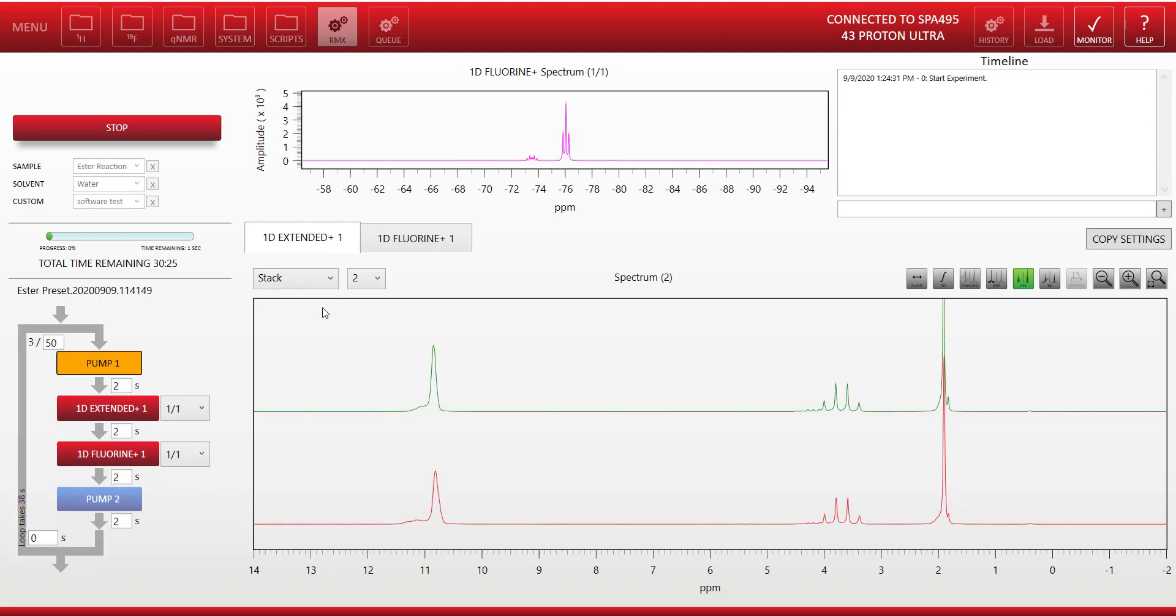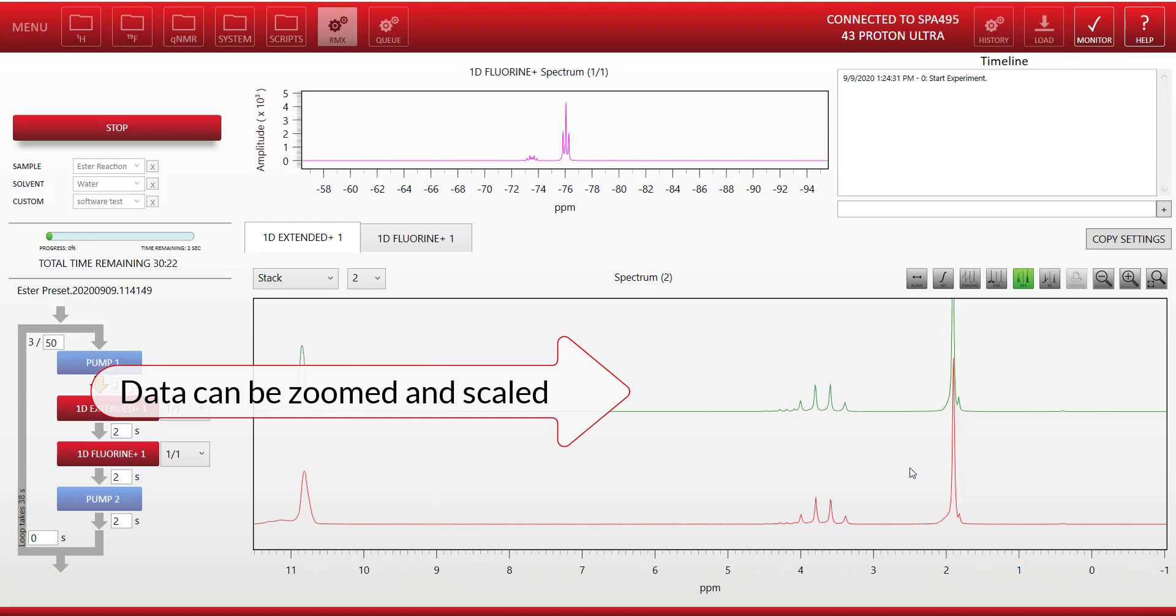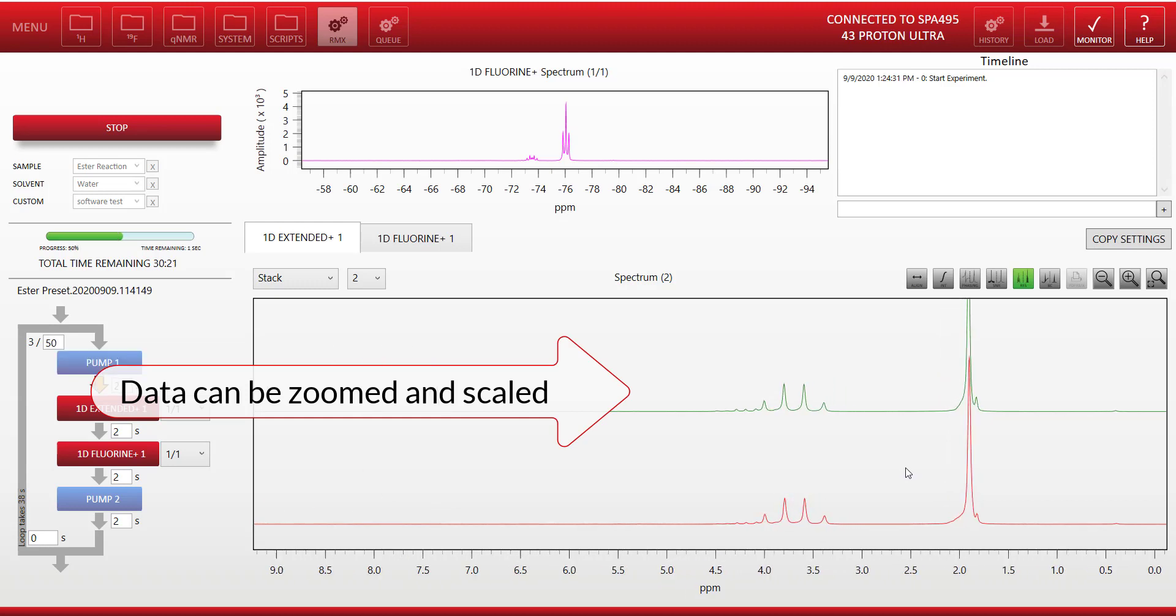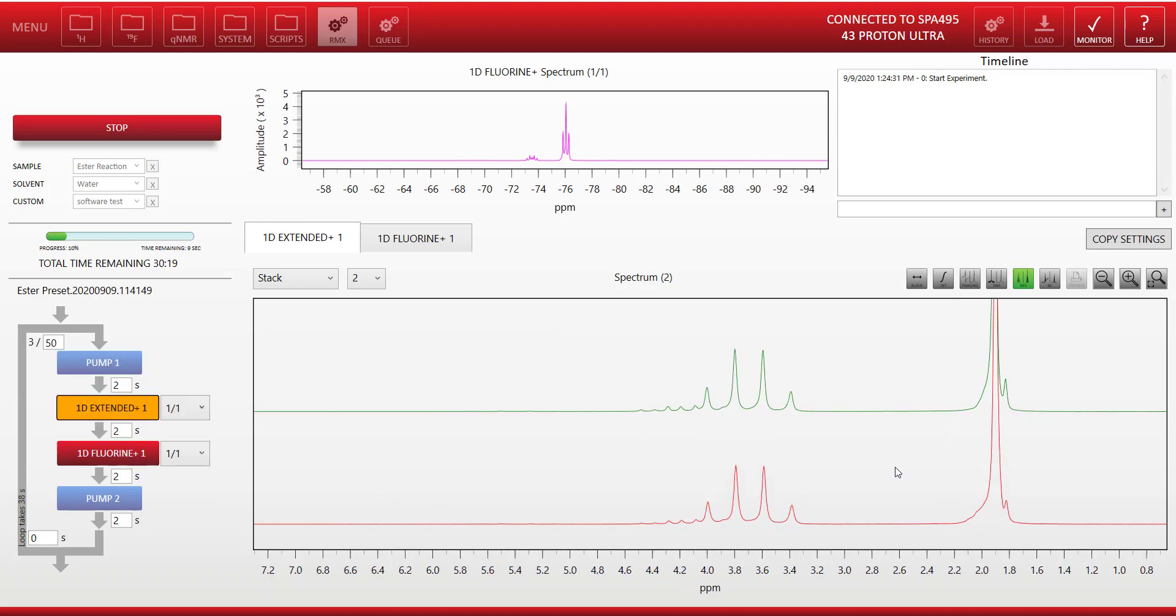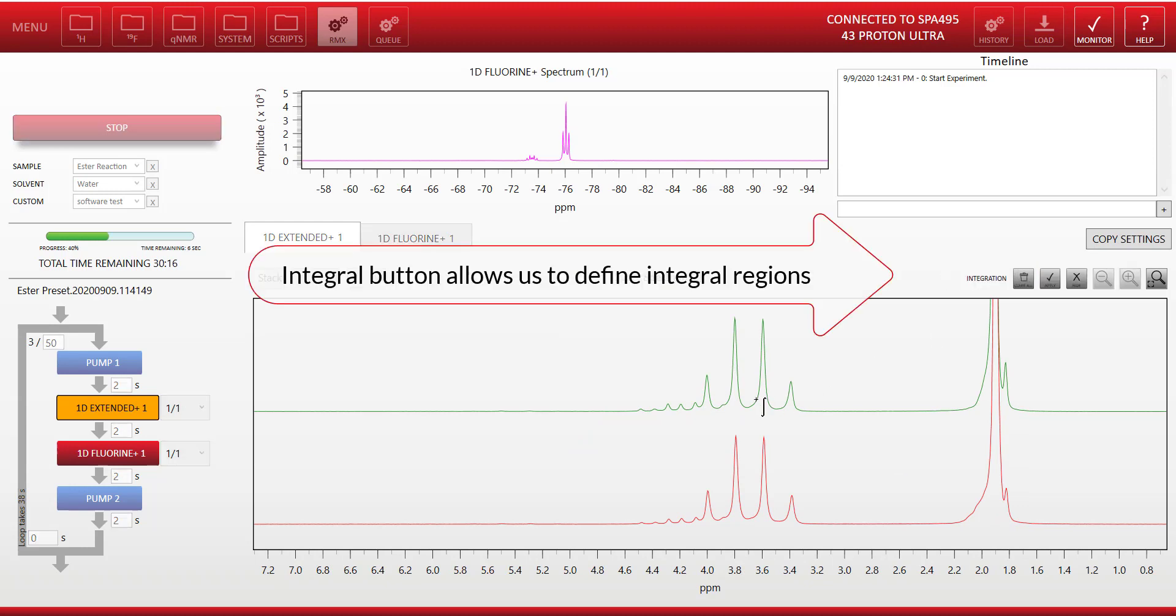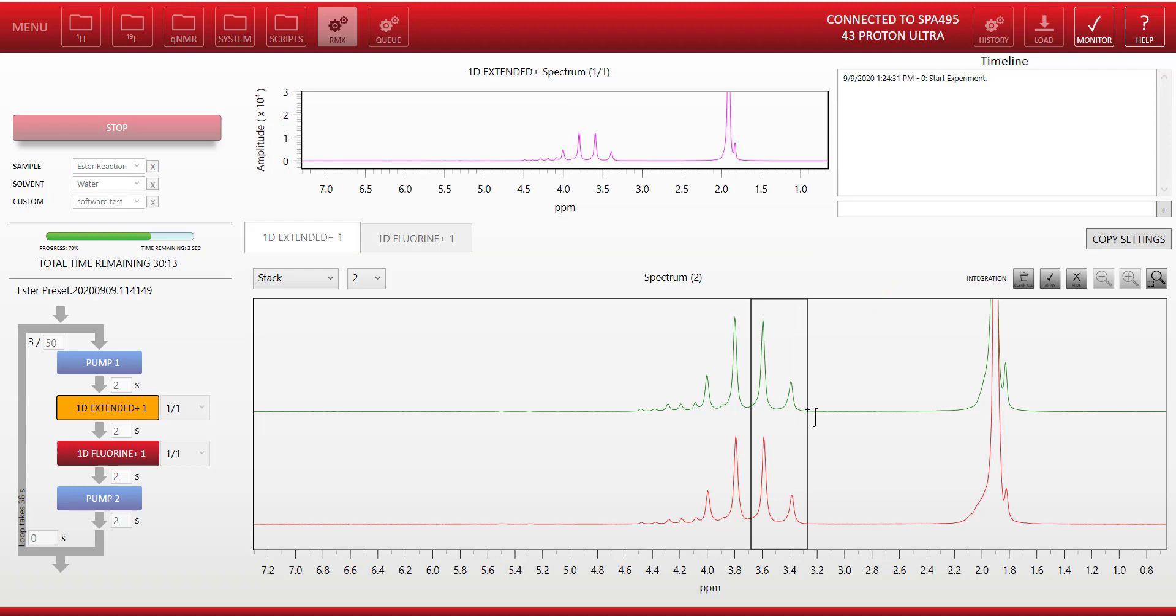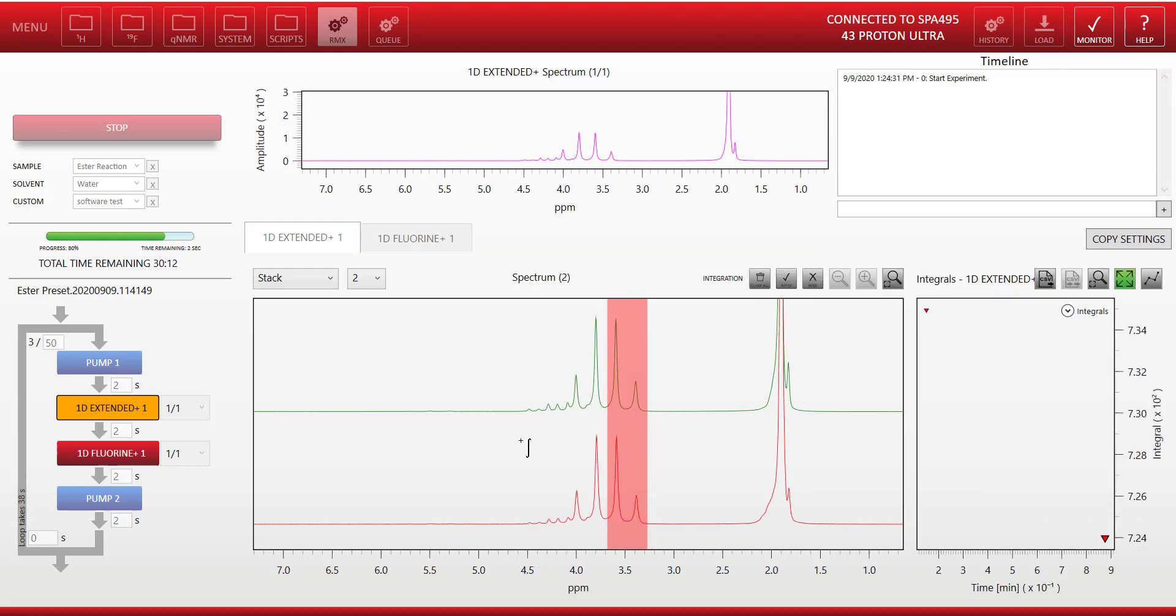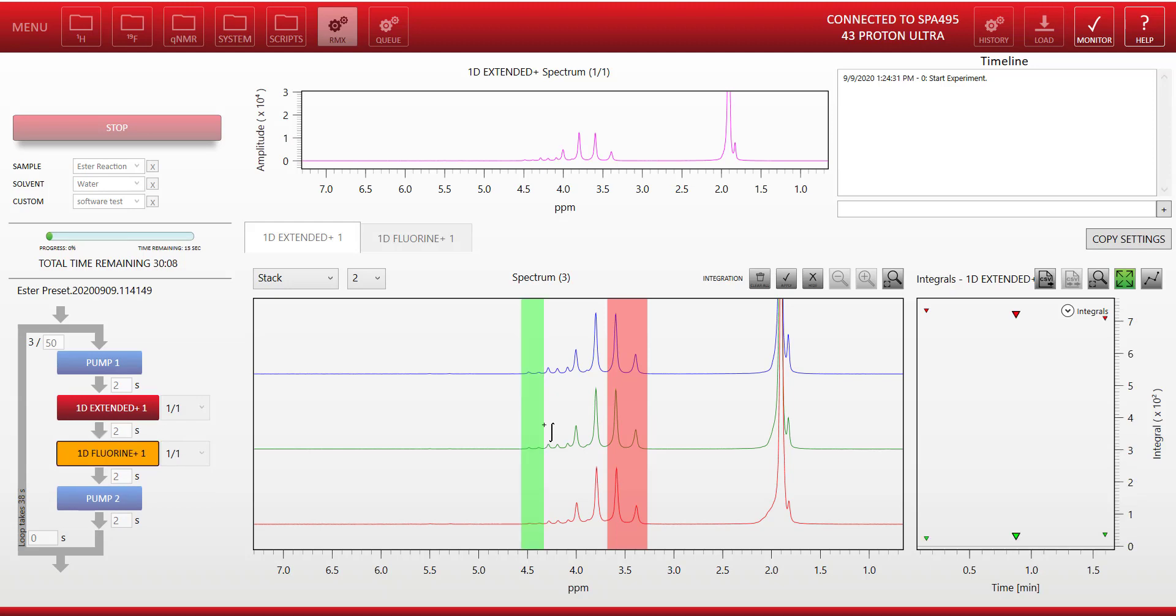We move back to the proton acquisitions now. We can see the stack plot accumulating there. The next thing we might want to do is to select some regions and do some integrals. So I'm going to integrate this region here, and then I'm going to set up a second integral on the left here, which is where I think my product is being formed.